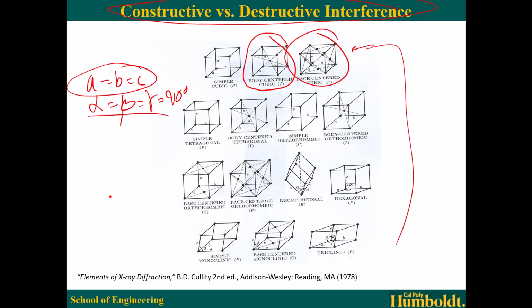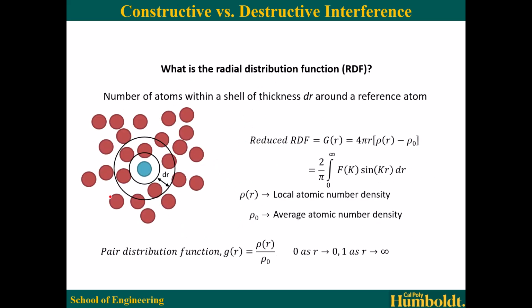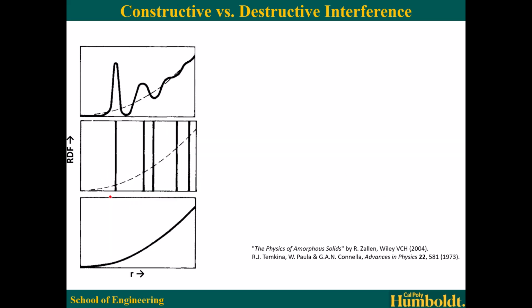But anyways, triclinic has the lowest degree of symmetry. Again, materials have short range order, but not necessarily significant long range order. Radial distribution functions: we can actually perform a Fourier transform of our PDF and RDF that we've discussed in class, and you can get your XRD plot. It's very complicated, and we won't be doing that in this course. But it's the same kind of idea of inverse space and Fourier analysis. It's critically related to these concepts, but you can do that in another class.